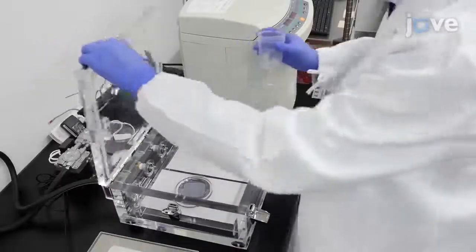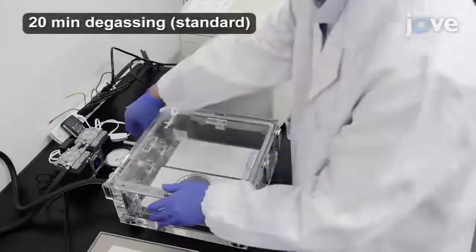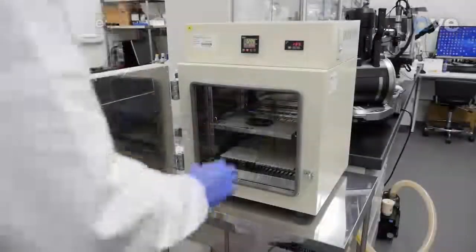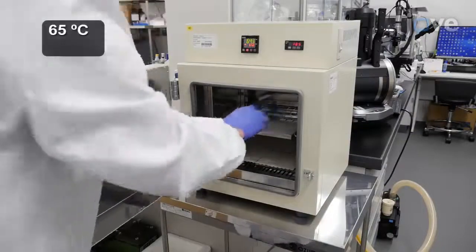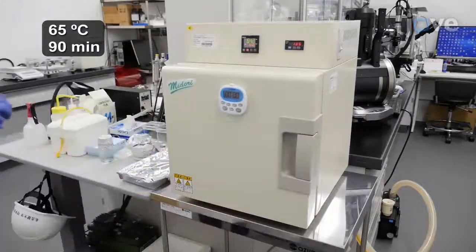Then degas the mold for 20 minutes in a vacuum chamber. Next, cure the mold at 65 degrees Celsius for 90 minutes.